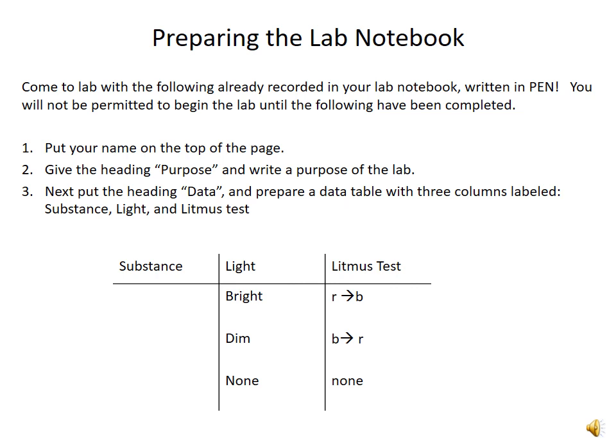And you're ultimately going to use these results to fill in a report sheet that you'll turn in. So just keep in mind the type of data that you'll be recording in this table. So again, just to reiterate, what you need to have done before you come to lab is just your name, a purpose, and then the blank table.